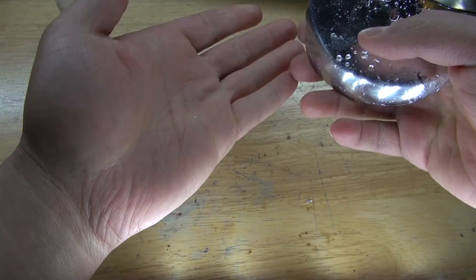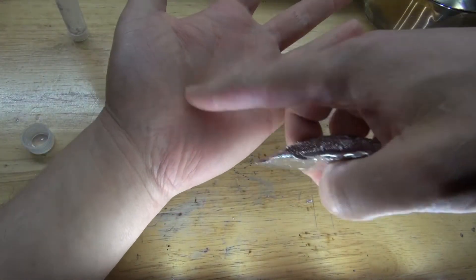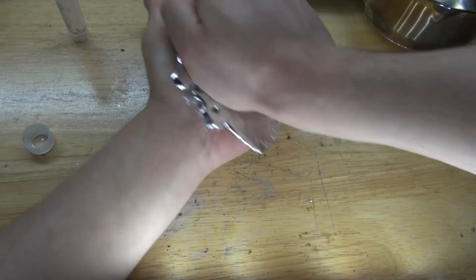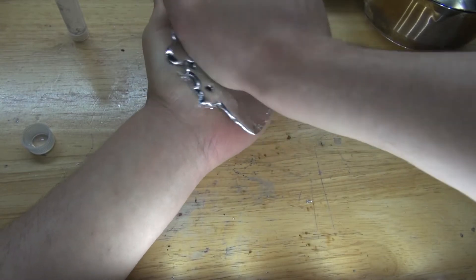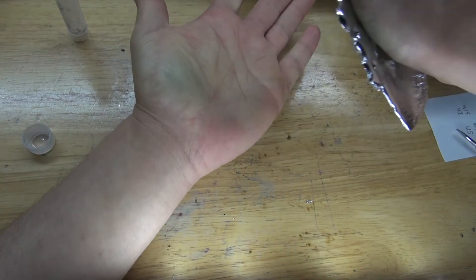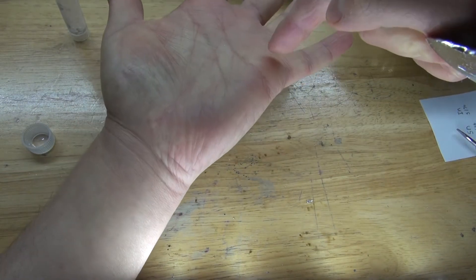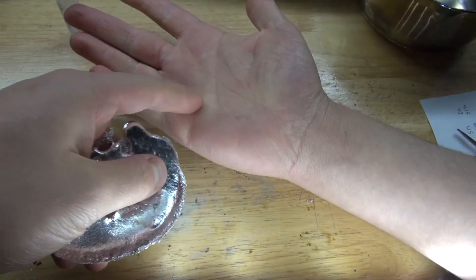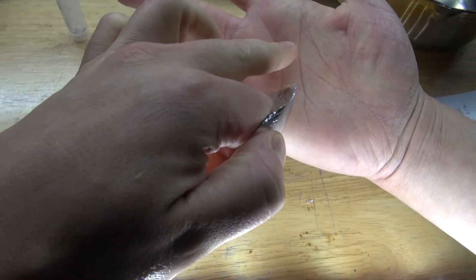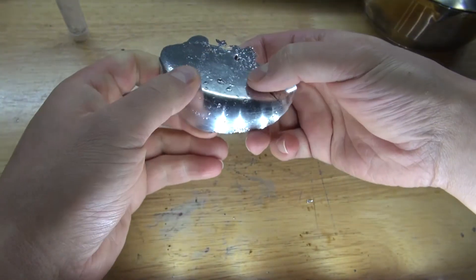Now, typically with indium and gallium it can stain your hands. I've washed my hands and I'm going to try rubbing it and seeing if I can stain my hands — like what gallium or indium would do, because with indium my hand would look gray. And it actually doesn't stain. Maybe just a little bit. Let me try again on a clean part of my hand. No — this does not stain your hands. How very interesting.